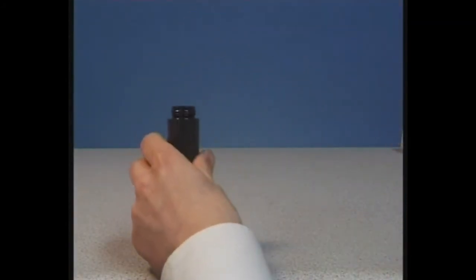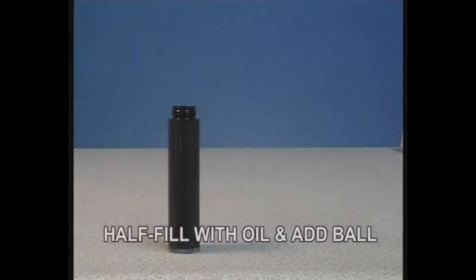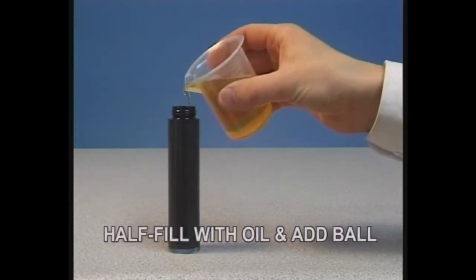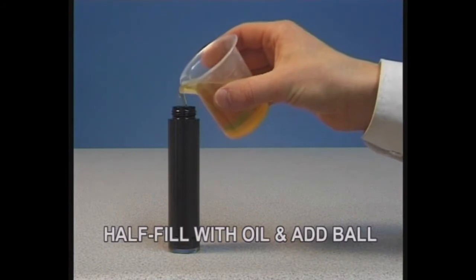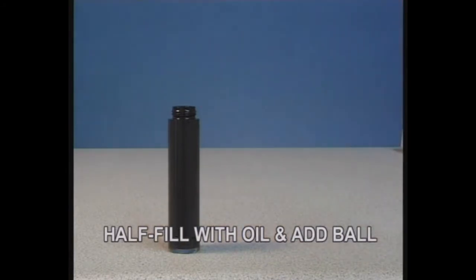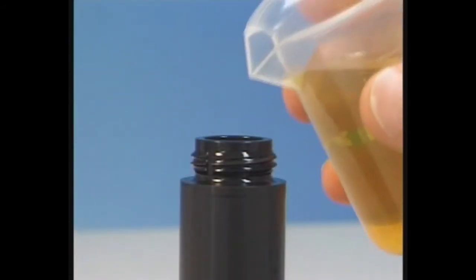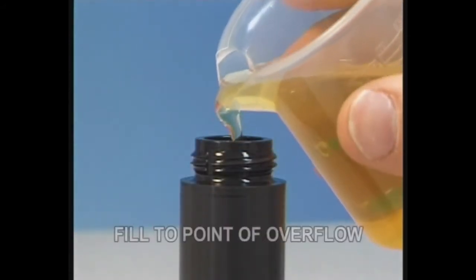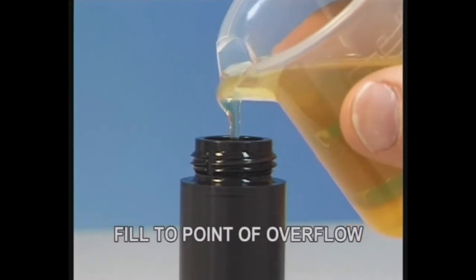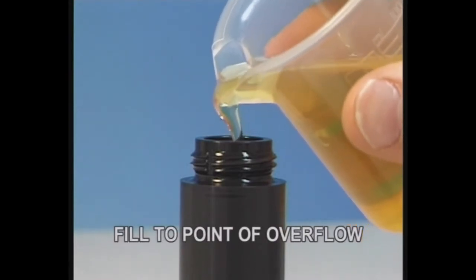Remove one end cap and half fill the visco tube with the sample oil. Place the ball in the visco tube. Top up the visco tube with the sample oil ensuring that the tube is completely full to the point of overflowing.